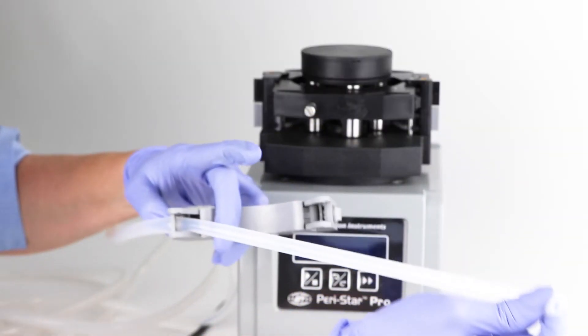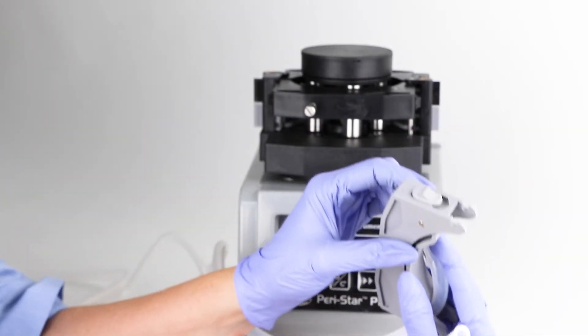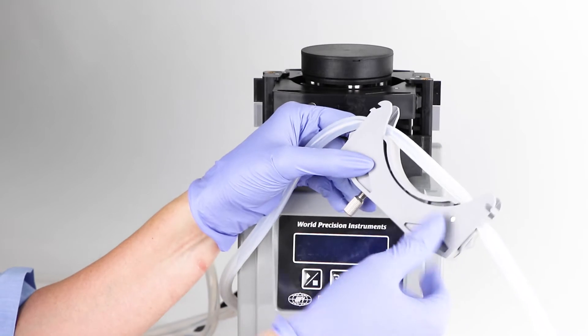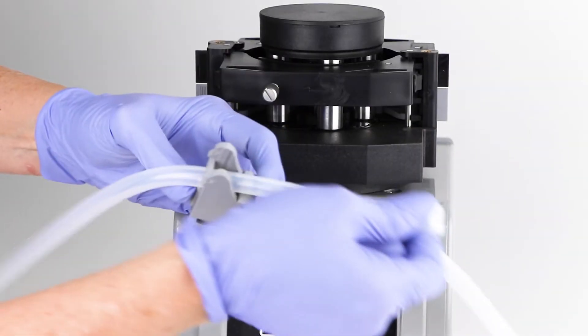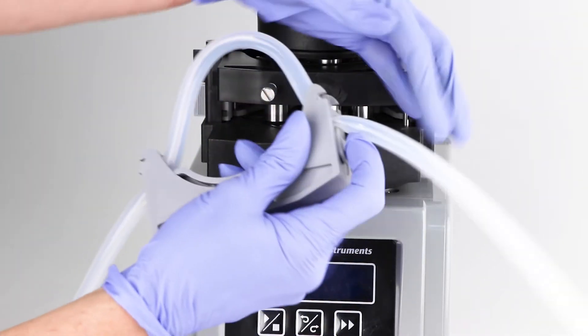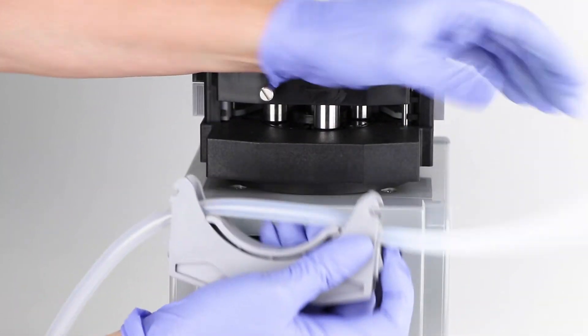Put a fresh section of tubing into the tubing fixture regularly. If the pump gets heavy use, do this weekly. A fresh section of tubing should be pulled through the pump rollers before the pump is left to run unattended.